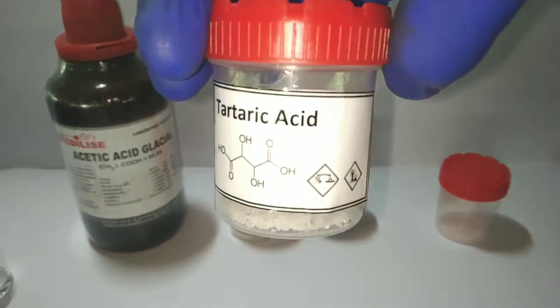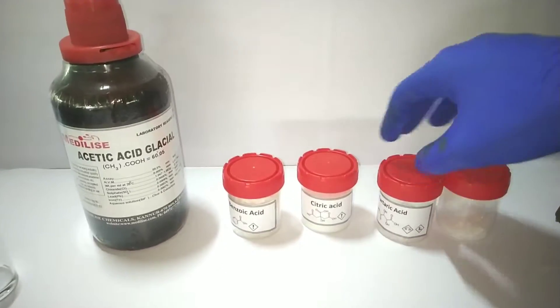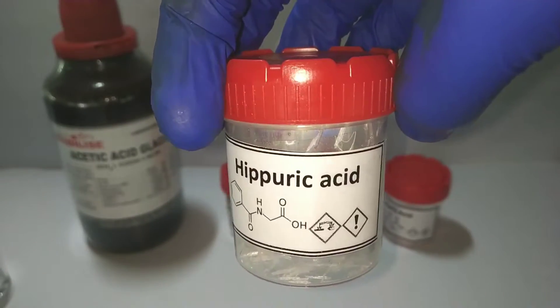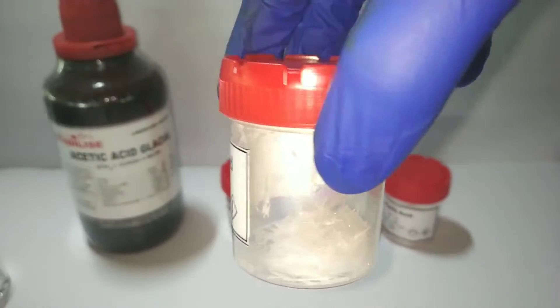This is tartaric acid, seen plenty in the fruit tamarind. And this is hippuric acid, which is normally excreted through urine when you have increased consumption of phenolic products like fruit juices and wine.